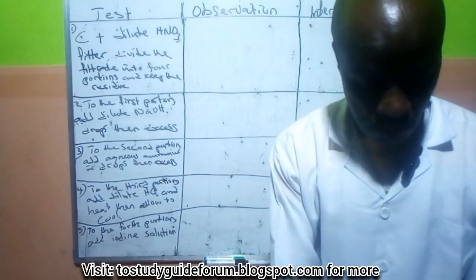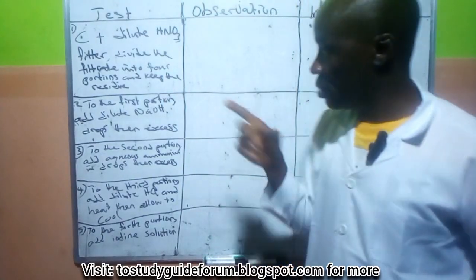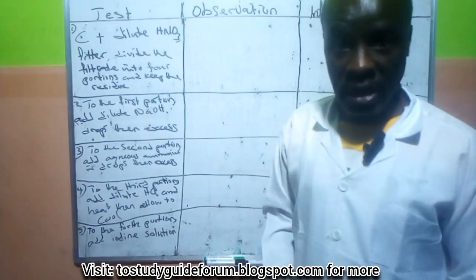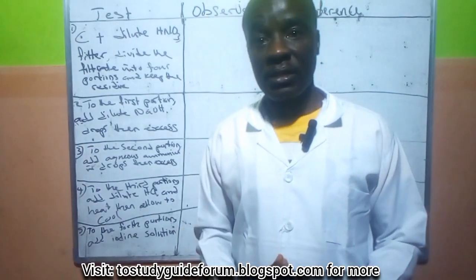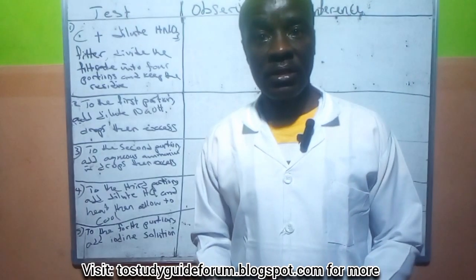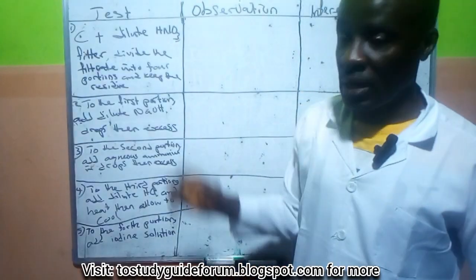As I'm doing the experiment, I'll be giving you all you need to know in the exam. So we're going to be analyzing lead carbonate and then starch from the information received. A mixture of lead carbonate, lead trioxocarbonate(IV), and starch. So we're going to be analyzing it now.